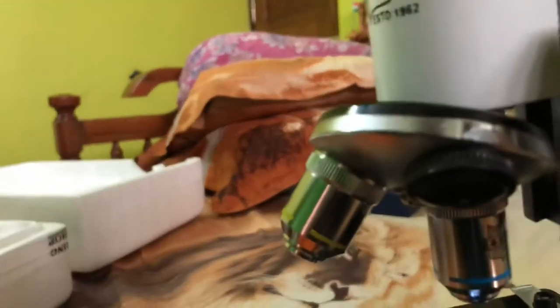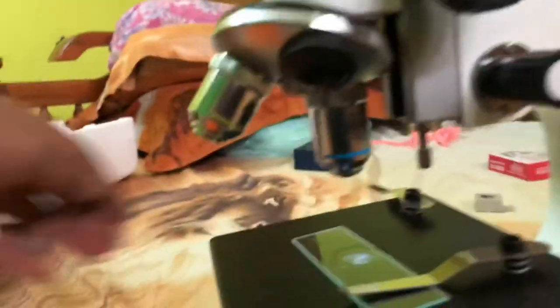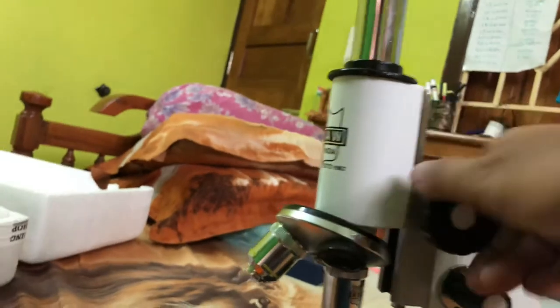The clips. The light — let's put on the light. We need a slide. This one. You're going to put your slide here, clip it on, put the specimen exactly above the light, then take a cover slip and put it over. And the only thing you're going to do is focus and look.